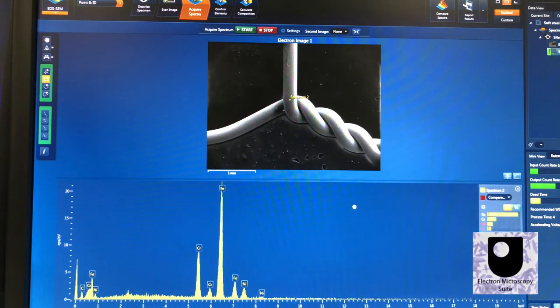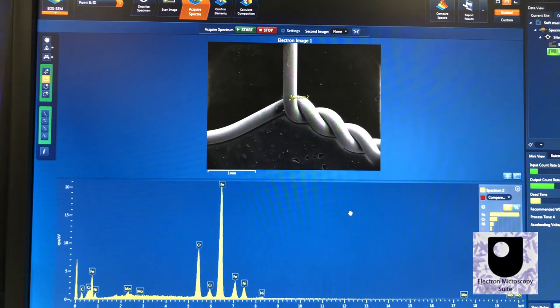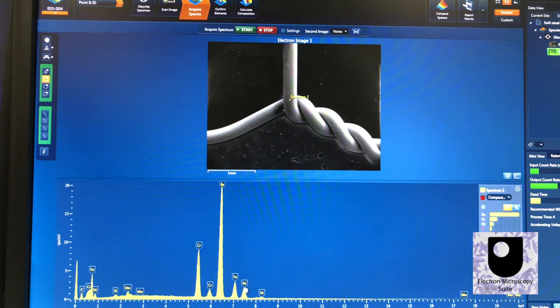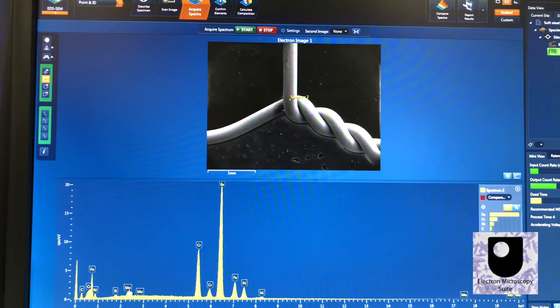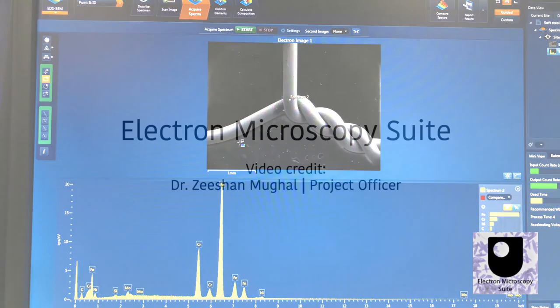Energy dispersive X-ray spectra provide information regarding elemental composition. This sample contains the element iron, along with smaller amounts of carbon, chromium, nickel, silicon, and molybdenum. This suggests that the sample is made of steel.